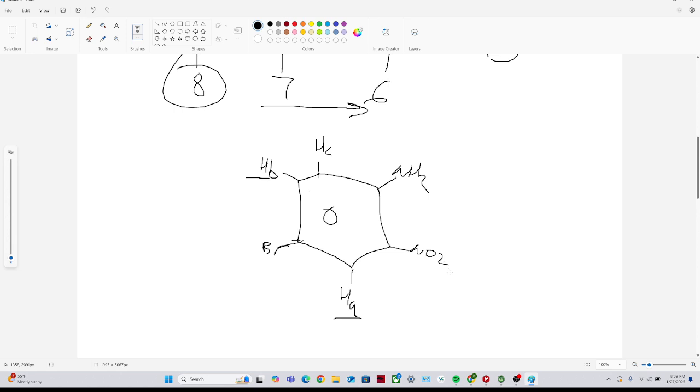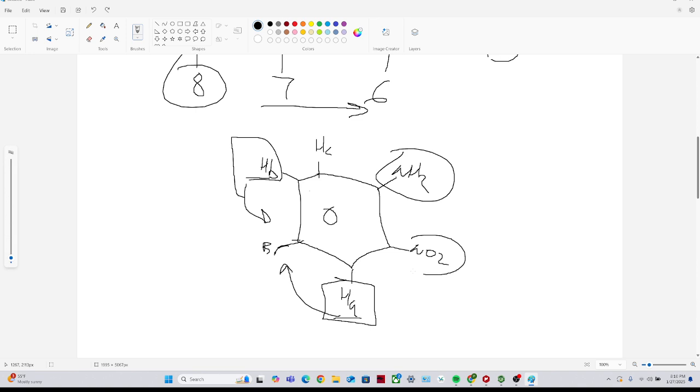And so in this case, you look at HB and you look at HA and you say, well, okay, they're both equidistant to the bromine, so they're both going to have electrons pulled away from them towards the bromine, so that does nothing. And then you look at the nitro group and the amine group. In both cases, HA and HB are going to be meta to the amino group, which is an electron withdrawing group by induction as well. And so you'll say, okay, the amino group doesn't help distinguish anything, but finally, the nitro group does. The nitro group, by induction, is pulling more electron density from HA because it's only ortho to it than HB.